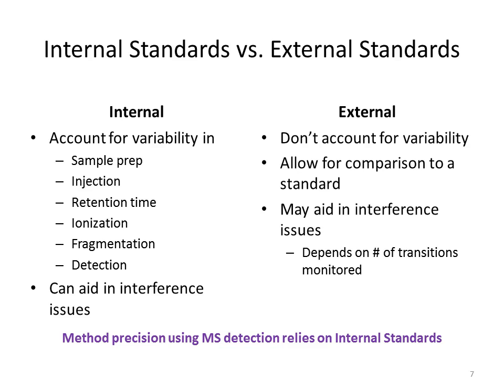If you dilute it in a different kind of plasma and generate a response curve of your peptide by diluting it with plasma that doesn't have it in it, so you're decreasing its concentration within a plasma background, that's a response curve, and you're able to generate a linear relationship with it, but it's not going to give you accurate information on a precise sample that you're measuring. You'll have to take whatever value you get from a separate sample and go to that plot and figure out the concentration. So does everyone see it's a little bit different? It requires multiple measurements, different samples.